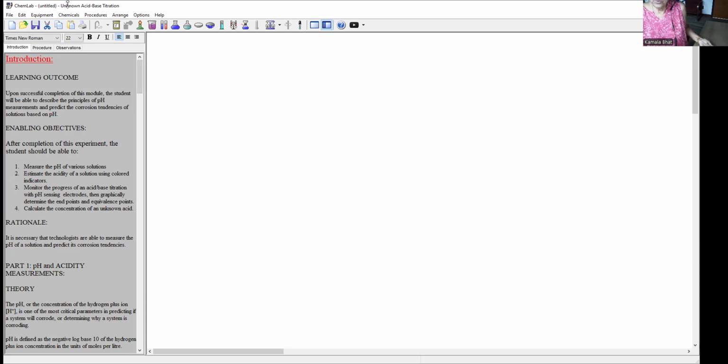This means that you have to write a balanced equation before you even start calculation, because in a balanced equation, you can write the neutralization reaction and it will give you the moles of acid required to the moles of base required in order to get a specific number of moles of water and the salt that is formed, because the reaction will be balanced.